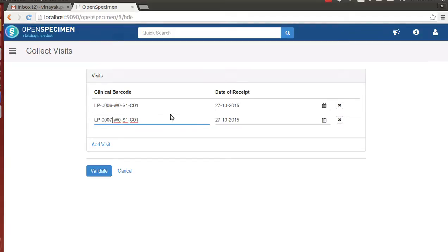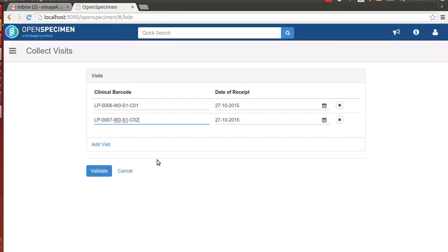Now we have inputted two clinical barcodes for two patients with different values. After inputting the clinical barcode, the technician clicks on validate to validate whether the barcodes inputted are correct or not.